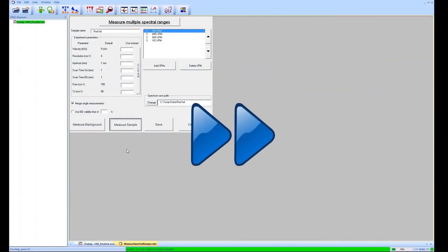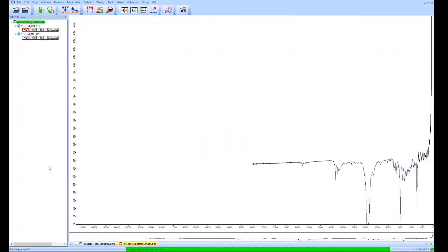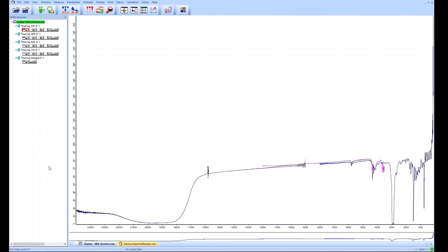The first measurement starts now — we have sped it up a little bit — and here we have our first result. It's the result for the FIR measurement and we can see the internal reflections of the foil. Now we have the mid-IR spectra where we can see the specific bands of the polymer of this foil. And last but not least, the final result in the VIS region, where we can see the absorption from the red color of this packaging foil.